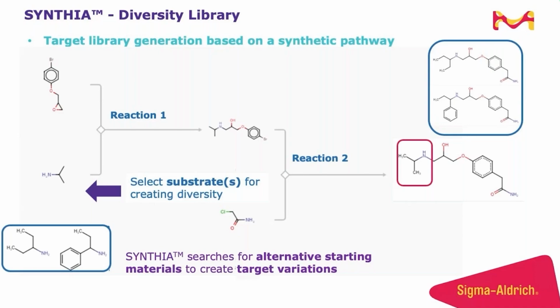What is extremely important to say here is that Synthia generates this library considering its entire power of the reaction rules database, this huge database we have, with all of this context information of incompatible functional groups in every reaction, and also the power of algorithms that are removing non-selective reactions, non-existent motifs, and all of these other algorithms we have built inside our Synthia tool. So all of this together means that the library targets that are generated are chemically correct and synthesizable.